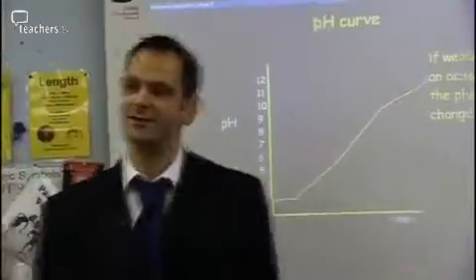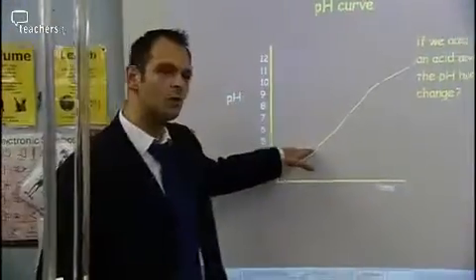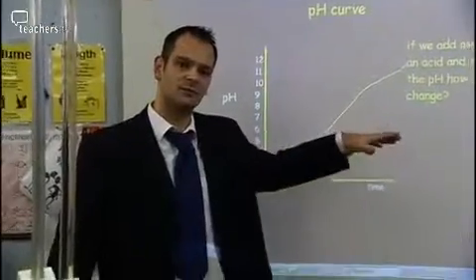At that. Okay, thank you very much. All right. That's not a bad idea. I can understand where she's coming from. She's kind of predicting that as we drop the alkali in, you're going to get more and more towards pH 7. Not straight away. It's going to take a bit of time.